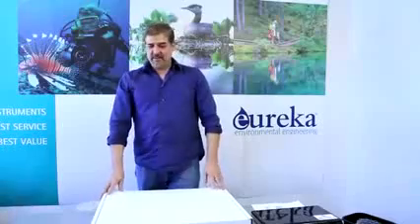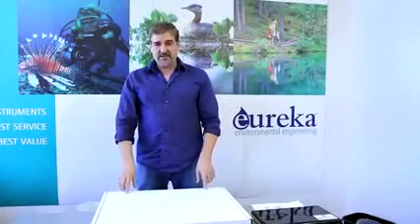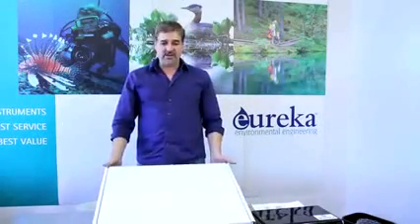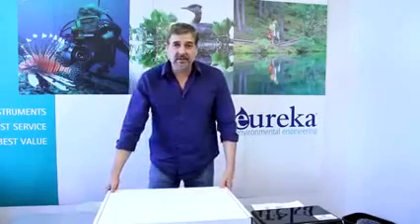My name is Gary Miller. I'm with Eureka Environmental. I've been in the industry about 20 years and we're going to discuss what's on a quick start guide and how to attach your instrument when you first receive it.